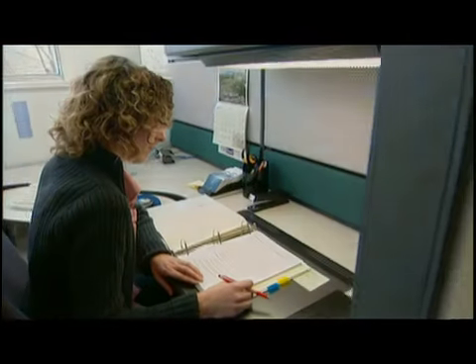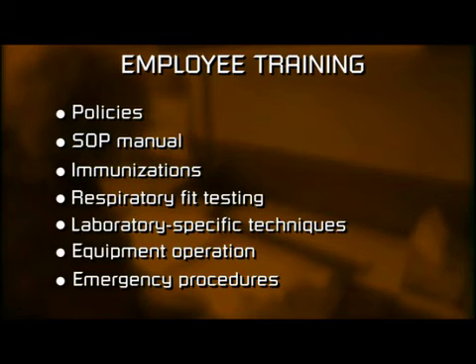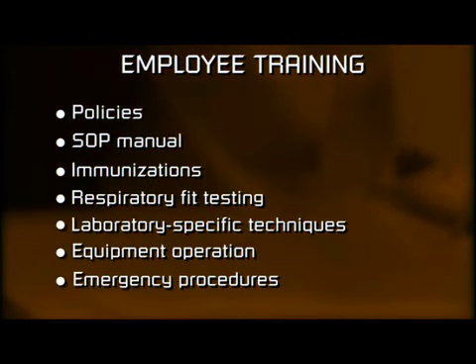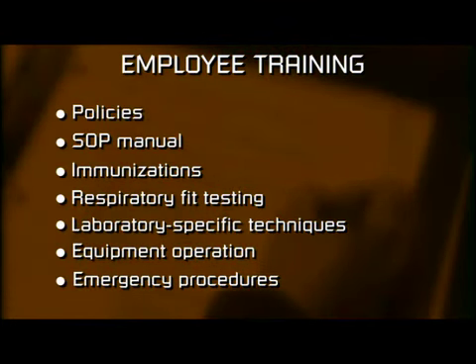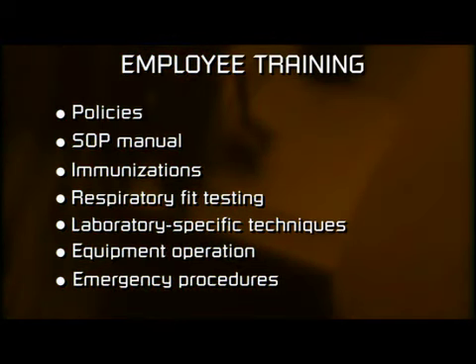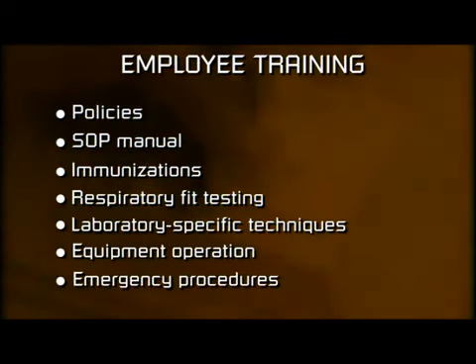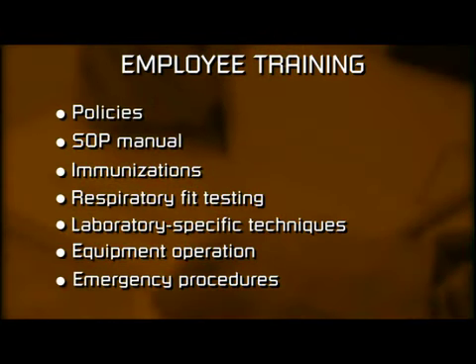As a standard operating procedure, all Containment Level 3 lab employees receive training specific to the operation and maintenance of the Containment Level 3 facility. They must be aware of the potential hazards associated with the work involved and the necessary precautions that must be taken. Lab supervisors are responsible for training and certifying that employees are familiar with the laboratory-specific protocols and are competent to work in the lab. Records of training must be kept for every employee.